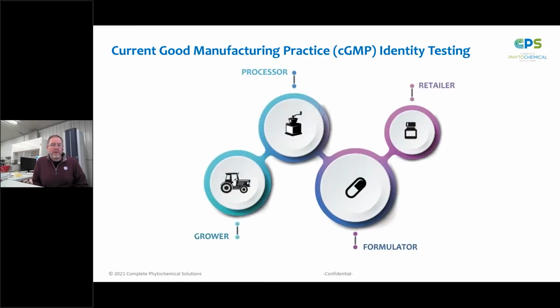We work across the spectrum of the marketplace, working with growers, processors, formulators, and retailers. So we may see an ingredient come through at multiple stages and support that identity and standardization testing throughout the entire workflow.